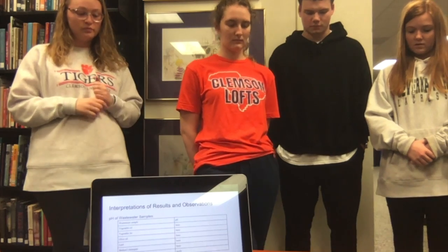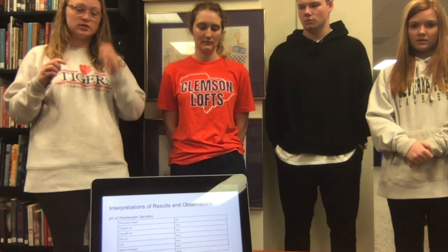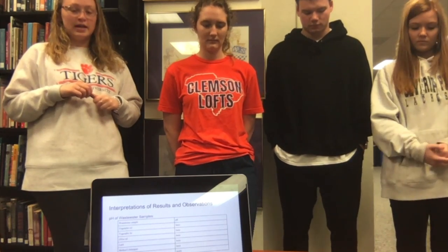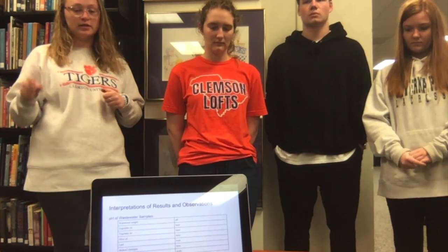And then week 3, we checked the pH of well water and pond water, and then we tested the soaps and detergents in the pond and well water to see if a scum would form. And then we performed ion tests to test for cations and anions as polluters in the water, and then based on what was in the water, we either performed a neutralization or a precipitation to clarify the water, and then we tested the soaps in the pond and well water to determine if scum still formed.